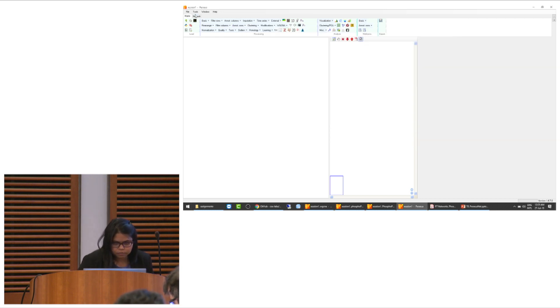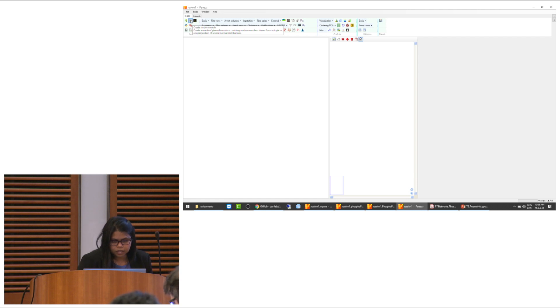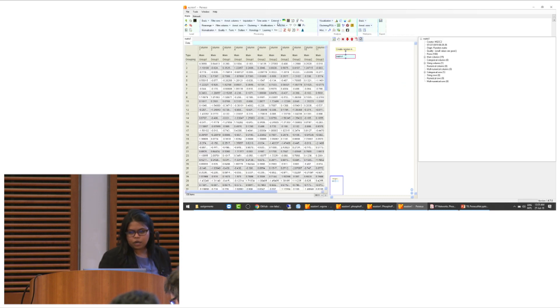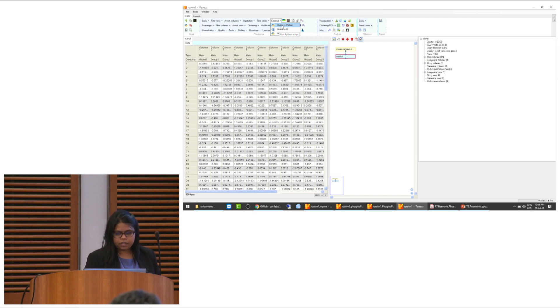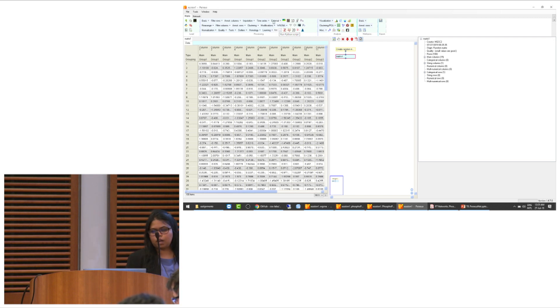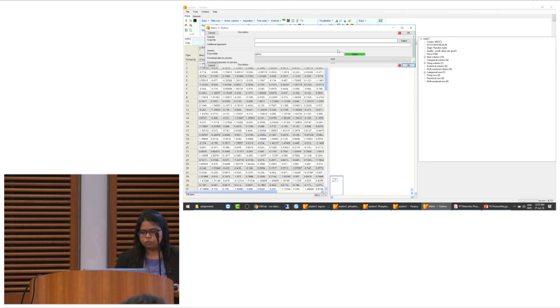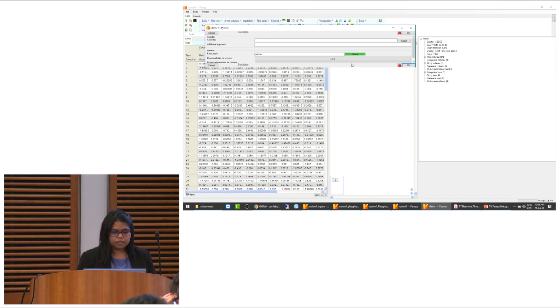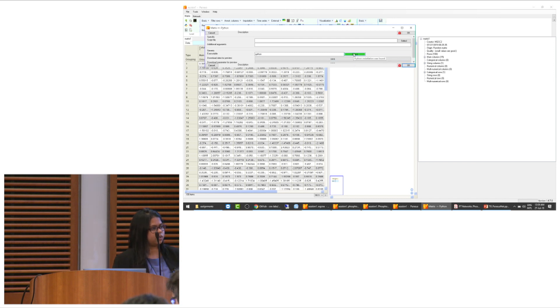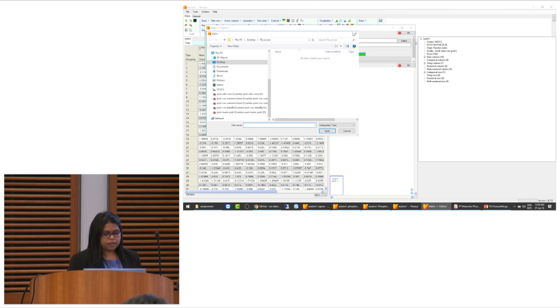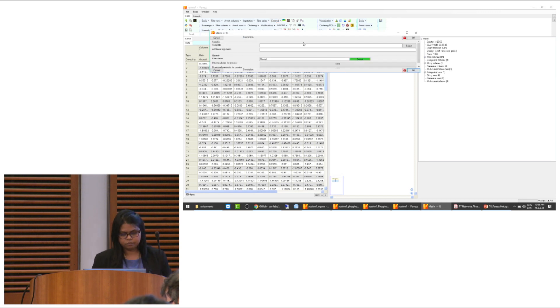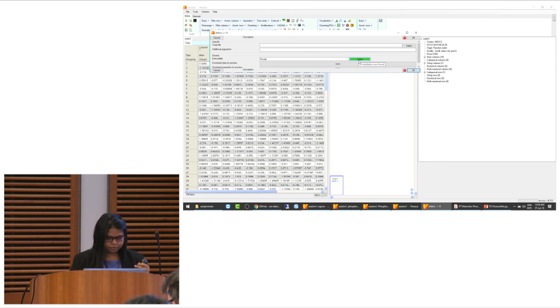Let's go to your USB stick. In the assignments folder, you can see there are three network assignments: P5, P6, and P7. In P5, we study how to upload a protein-protein interaction network to Perseus and how to use it for signal functionality score calculation. In P6, you can do co-expression analysis using a powerful R tool known as WGCNA. In P7, there is phosphoanalysis using PSP for protein kinase study.